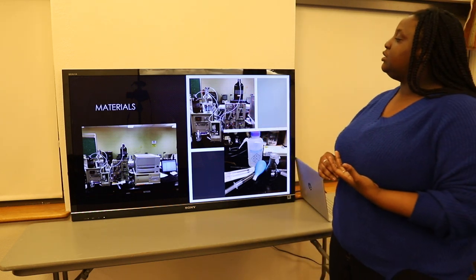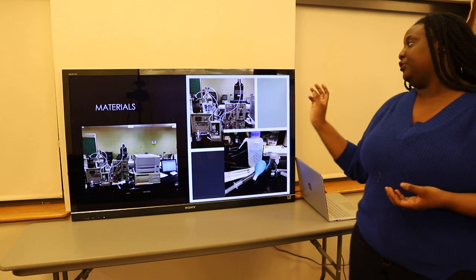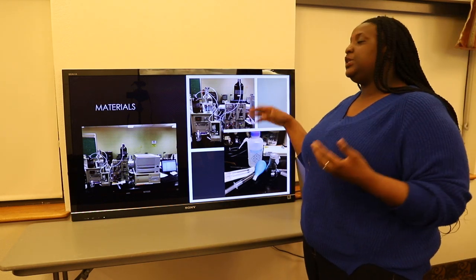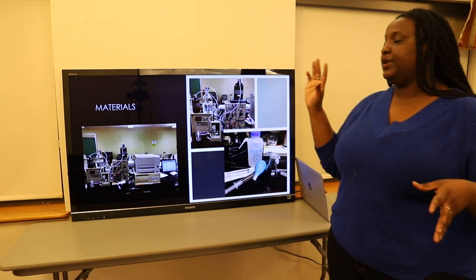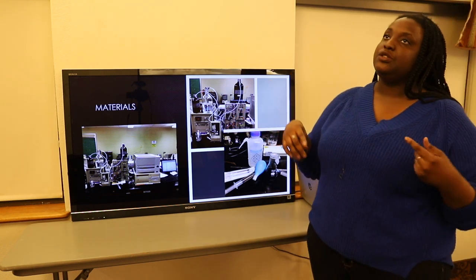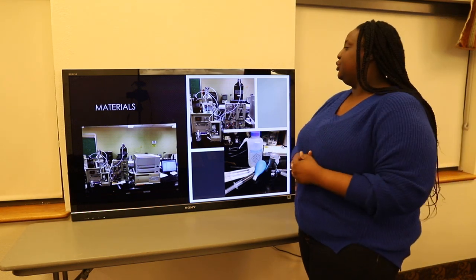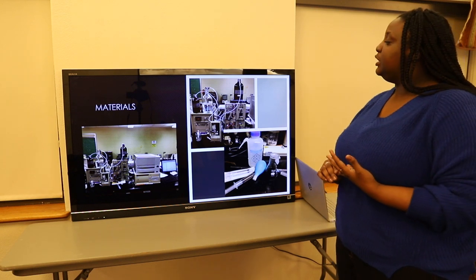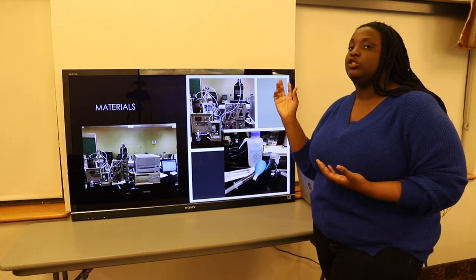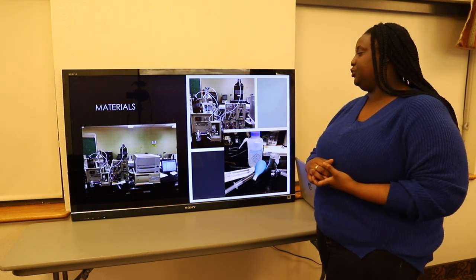So for the first 3 minutes, the first pump ran at 0.0 and the second one ran at 0.5. And after 3 minutes, I switched the pumps, and the first pump ran at 0.1 and the second ran at 0.4. I did that throughout the time frame of 25 minutes for each run. I started with pure tea first, so I injected the tea into the HPLC column, and I determined the peaks that came off on the computer.